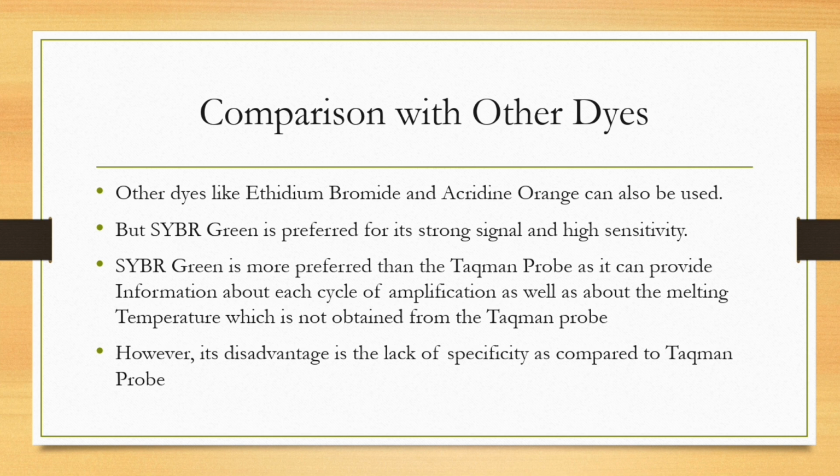SYBR Green is more preferred than the TaqMan probe, as it can provide information about each cycle of amplification, as well as about the melting temperature, which is not obtained from the TaqMan probe. However, its disadvantage is the lack of specificity as compared to TaqMan probe.